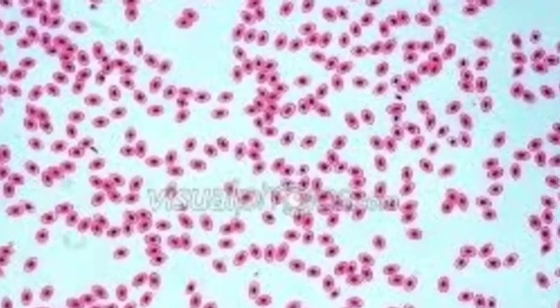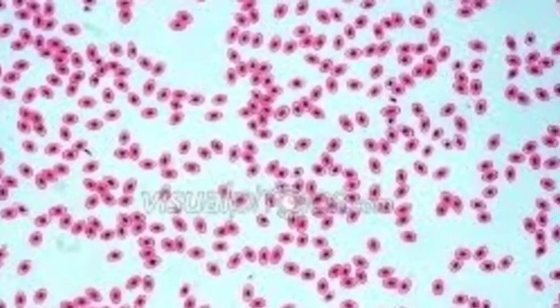This is a view with the 10 times objective lens. This image is being magnified a total of 100 times. Notice you've lost some of the image, but you've gained a little bit of detail.